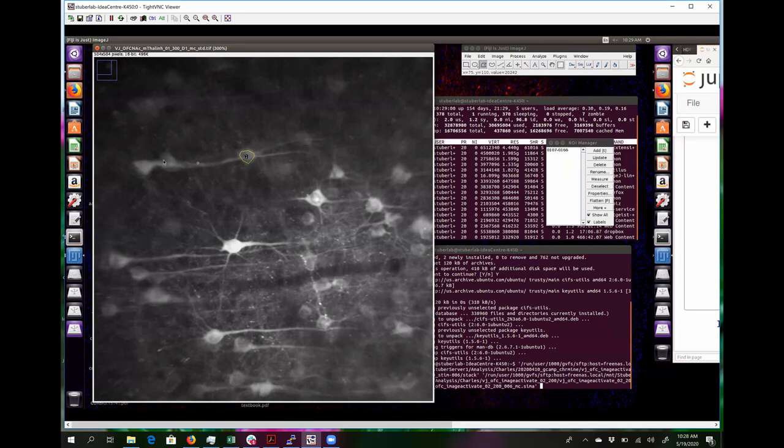And this is a key part. These are pretty far away from the cell. Under normal circumstances, there's probably no way that this cell is going to affect the activity of a cell that's so far away. But it does, because its process is actually going all the way to the other cell.